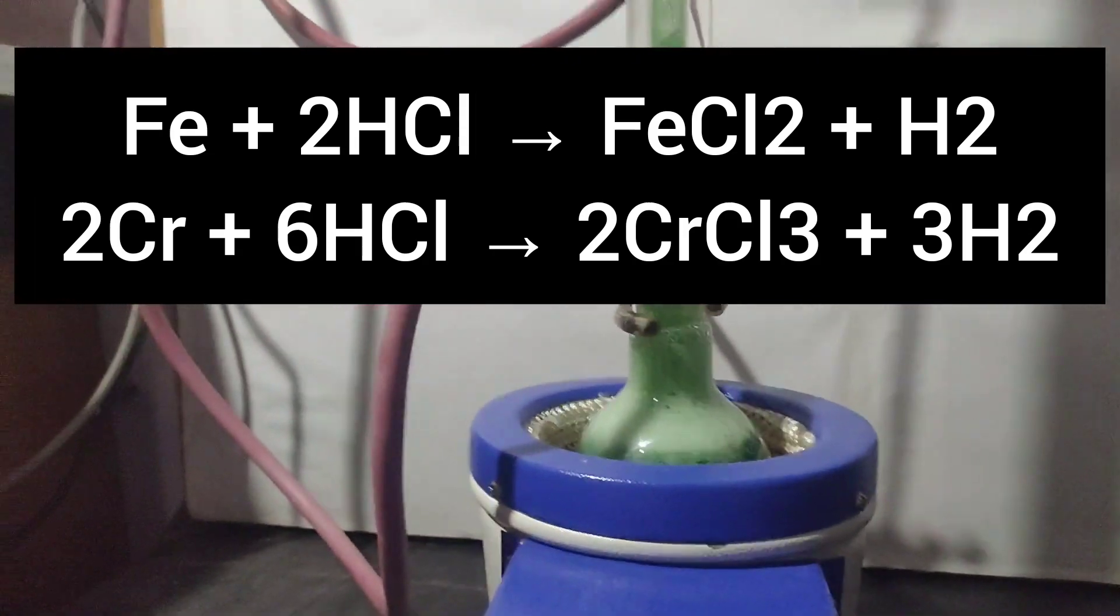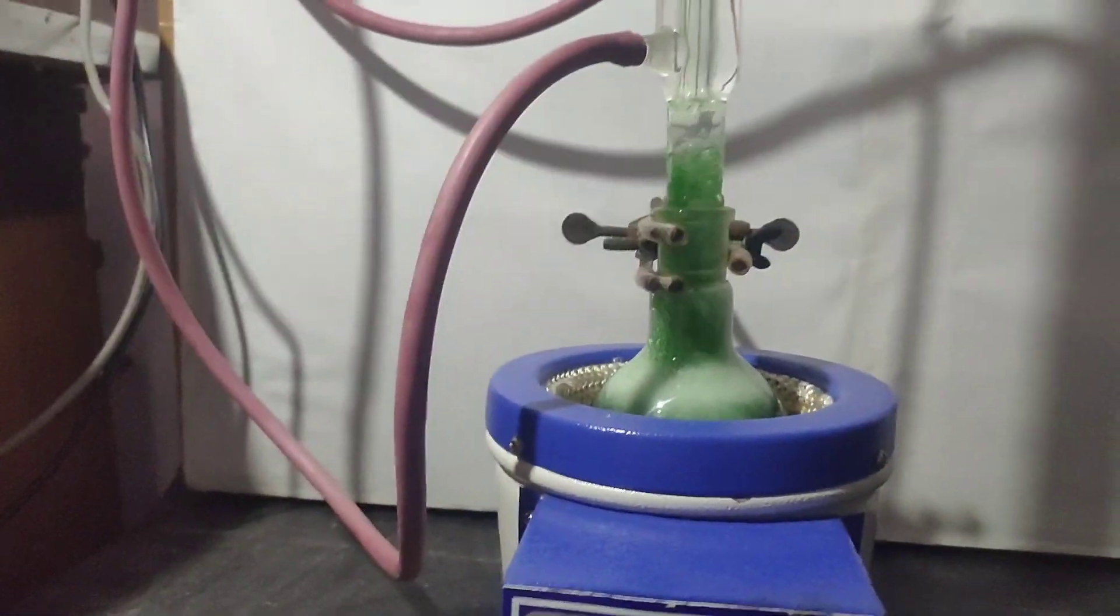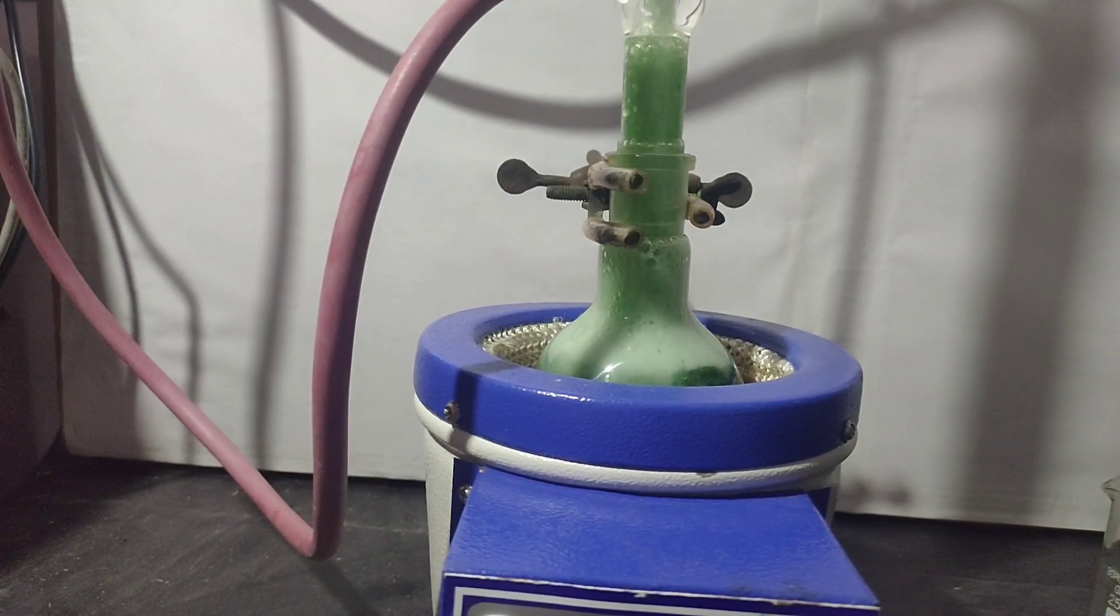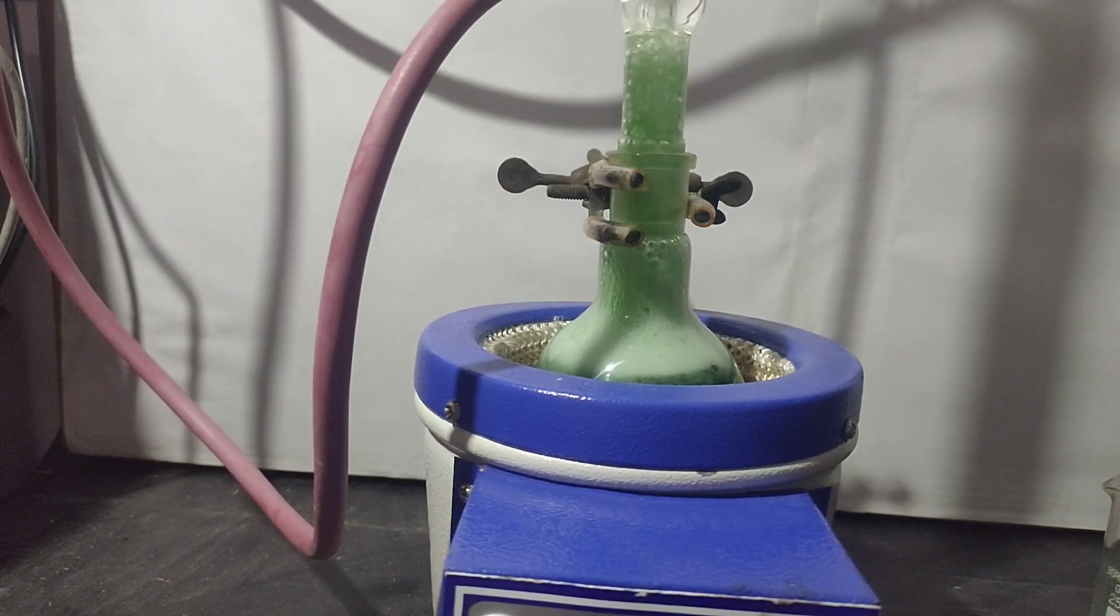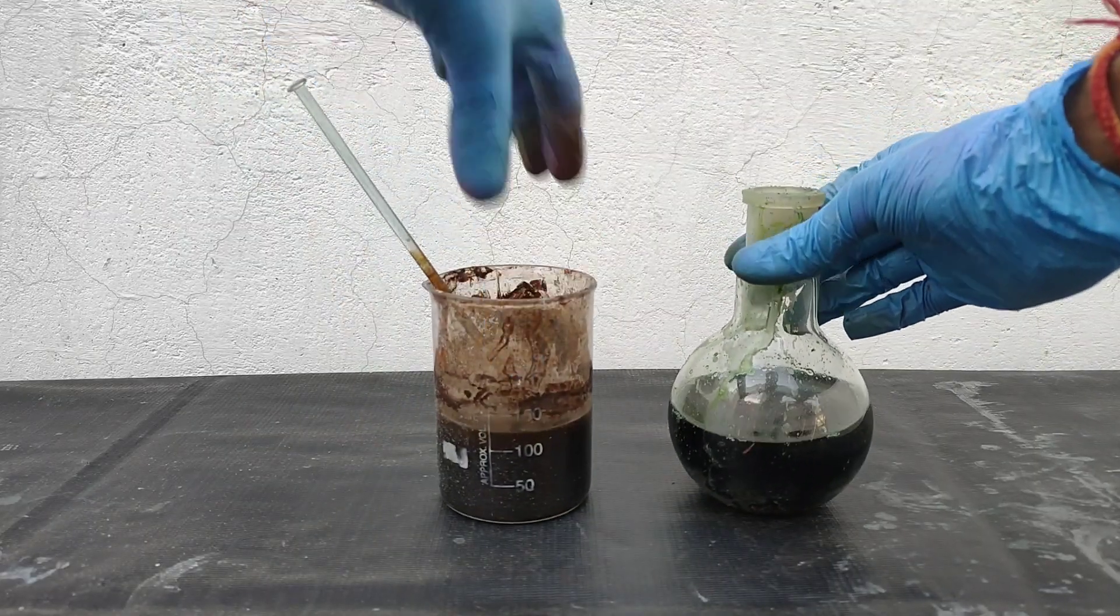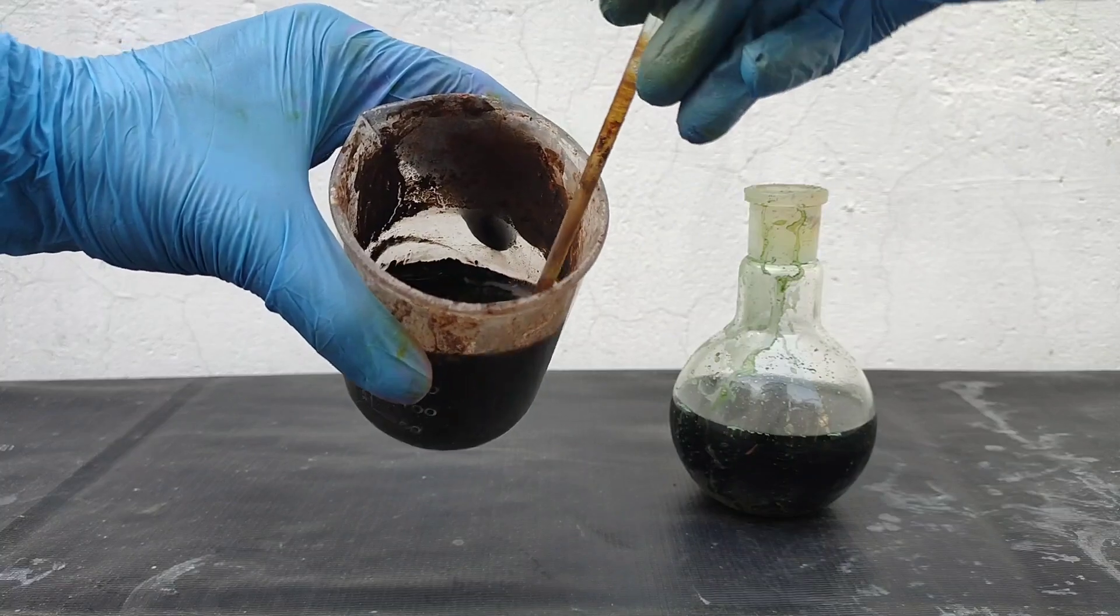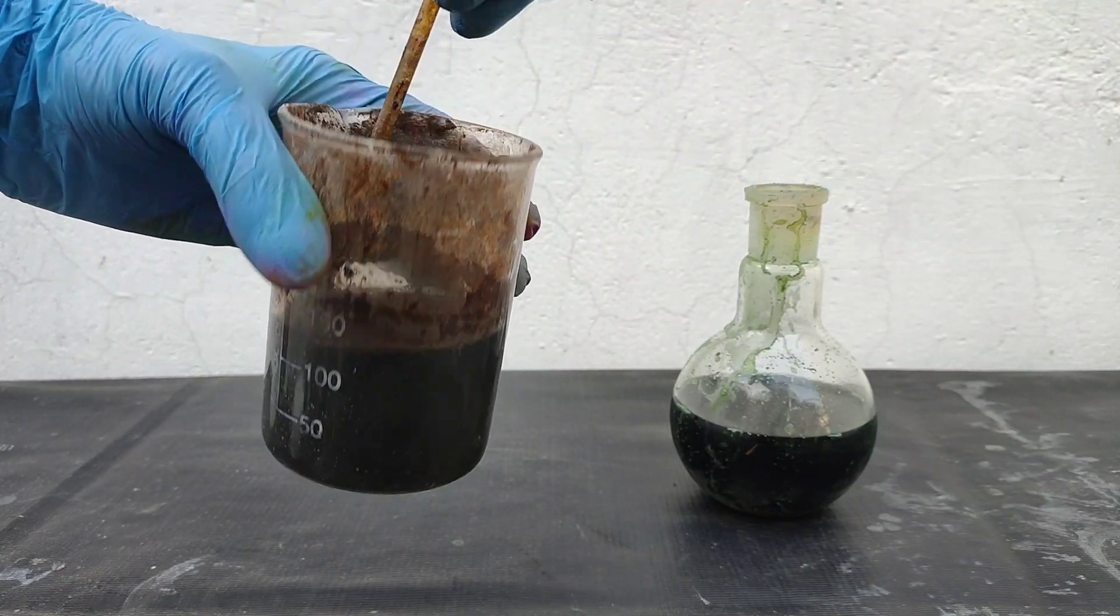After all the acid has reacted with steel and even on heating no evolution of hydrogen gas takes place, the reaction is over. Now in the left beaker I have a precipitate of iron and chromium hydroxide from electrolysis.